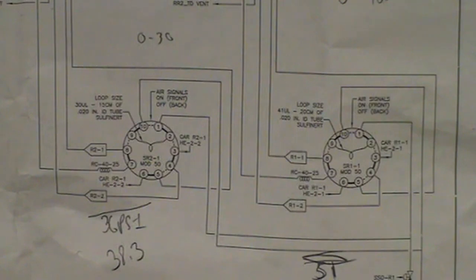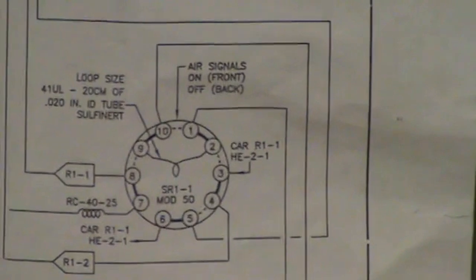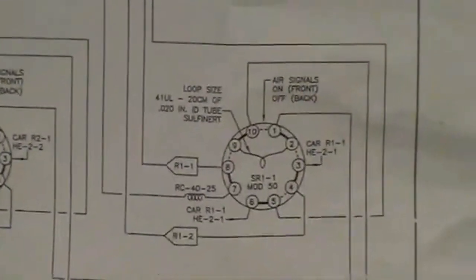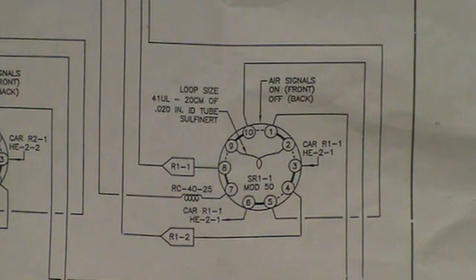We're going to go to 2. We only need to look at one of them. We don't need to look at both. We're going to come in on 1, go through the solid line internally because we're in the off position to 2. Fill the external sample loop, 9. Internally, go to 10, and then we're back out. Circulate, circulate, circulate fresh sample.